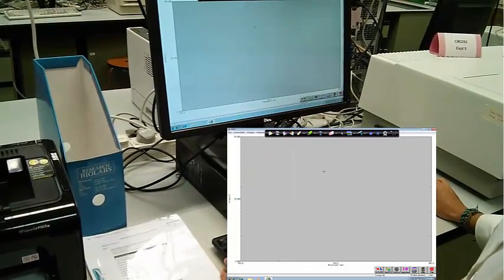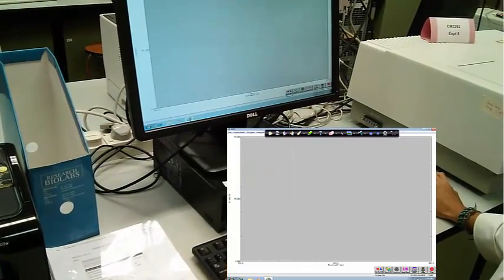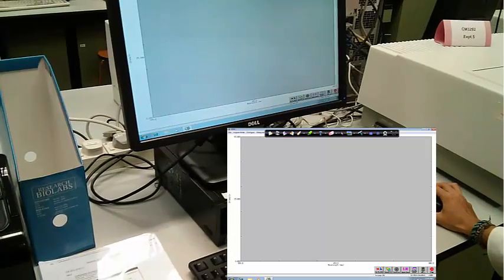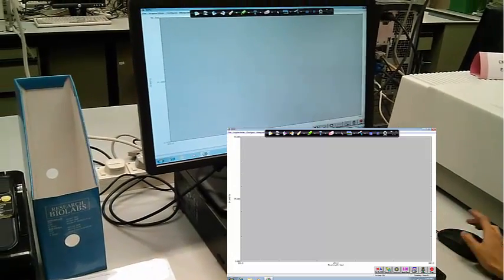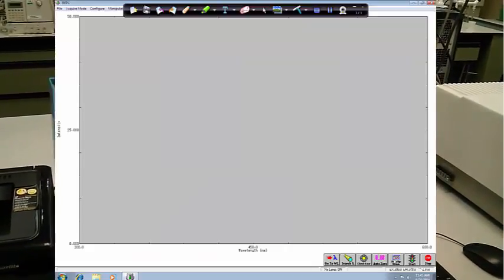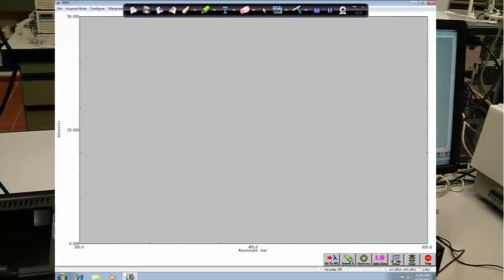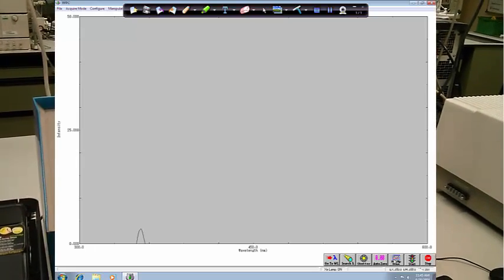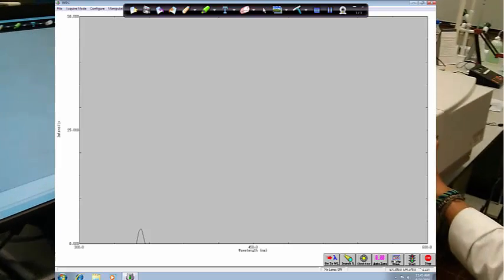Once we've set all our parameters, all we need to do is click the traffic light sign start, and our machine will start scanning. You'll hear the click. Yeah, just remember not to open the box when scanning.